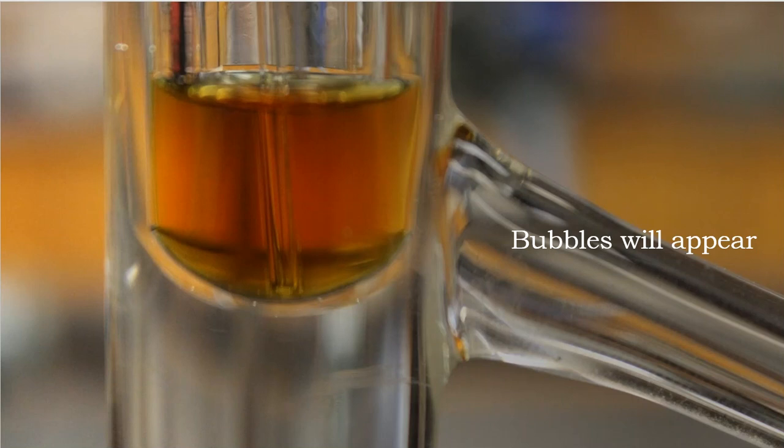Now the whole purpose of this capillary tube is that my liquid will begin to bubble and boil, and I'm going to see bubbles come from this capillary tube when that happens. At this point, I'm going to take away the heat and allow this to settle back down. When the last bubble pops out of that capillary tube, I'm going to read the thermometer, and that thermometer is going to tell me the boiling point of that liquid.